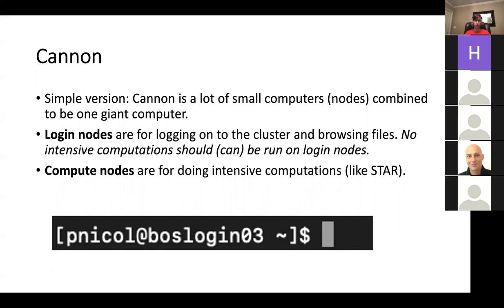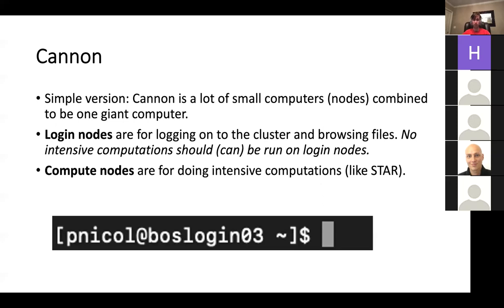There are basically two kinds of nodes you'll encounter on Canon. The first is login nodes — these are the ones you go to when you first SSH into Canon. You can tell if you're on a login node by looking at what comes after your username. For example, 'Boston login three' means it's the third node in Boston and it's a login node. These basically serve just to get you on the cluster and allow you to look around at different files, but you really shouldn't be doing any intensive computations on the login nodes.